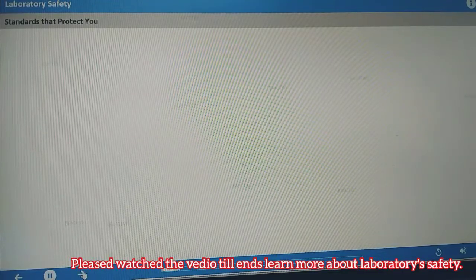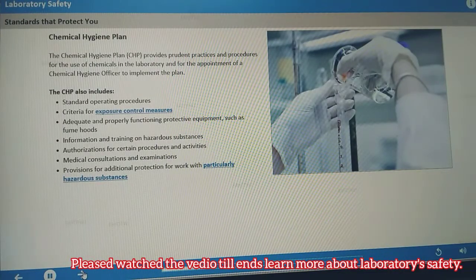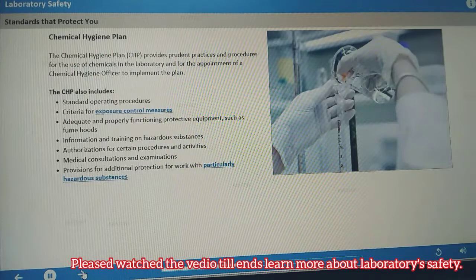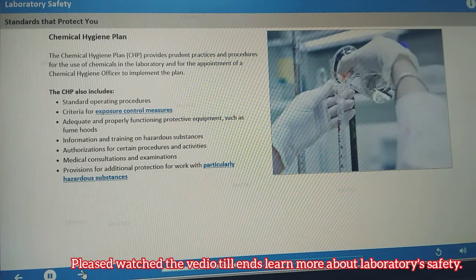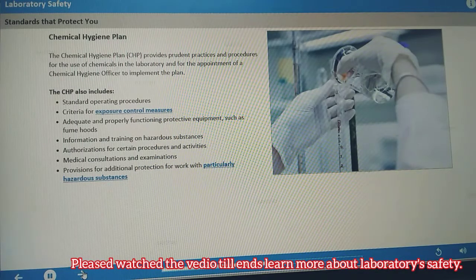Under the standard, the Chemical Hygiene Plan provides prudent practices and procedures for the use of chemicals in the laboratory, including laboratory and personal protective equipment. The plan must indicate specific measures an employer will take to ensure your protection and provides for the appointment of a chemical hygiene officer to implement the plan.